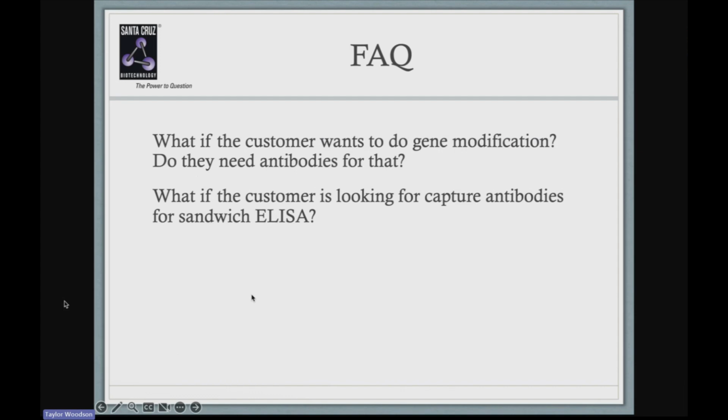Okay, and then what if they're wanting to do capture or looking for capture antibodies for sandwich ELISA? So actually, believe it or not, we do not support sandwich ELISA. So if you ever have a customer that is wanting to get capture antibodies through Santa Cruz Biotechnology, we don't have validated capture antibodies for sandwich ELISA. So just something I wanted to mention here. Sometimes we get that question.